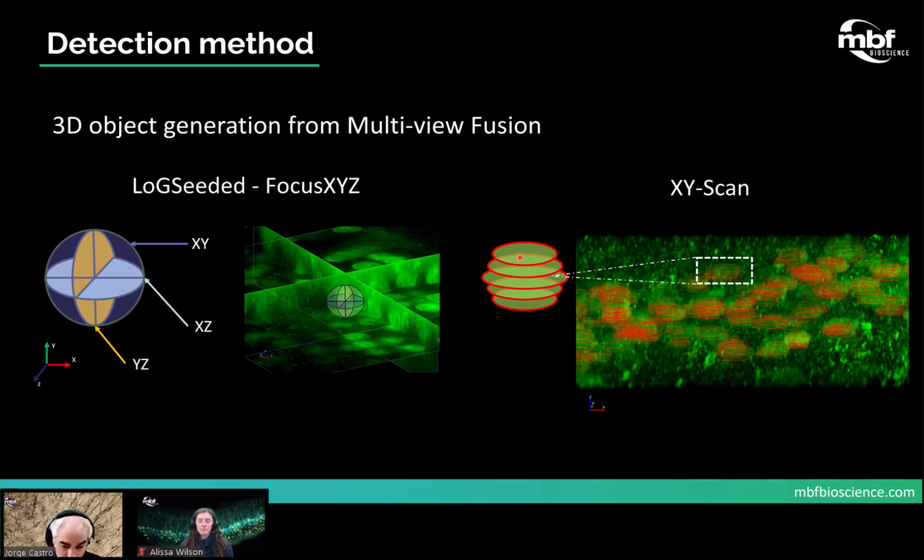Remember the video that we had before where the human counter was going up and down in the stack. So yeah, the person would just see when the appearance of the top of the cell would happen and then would place a marker for that. So instead of the tops, Stereo Investigator uses the centroids. This really does not have any impact other than when we do the validation of what the software has counted, we'll need to specify if we are counting tops or, as the computer is doing, centroids.